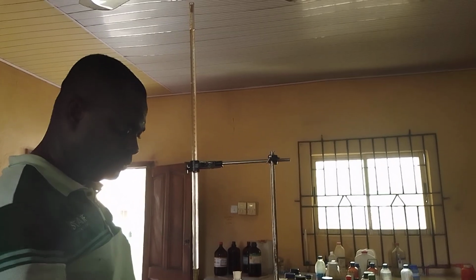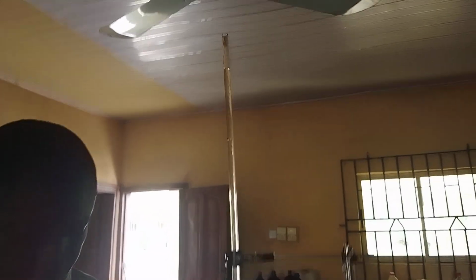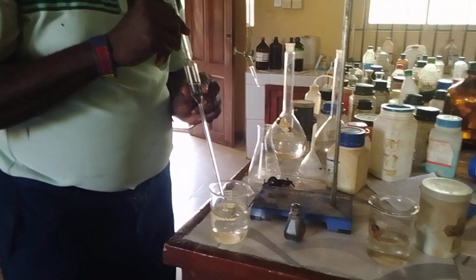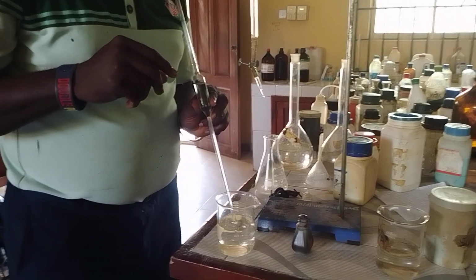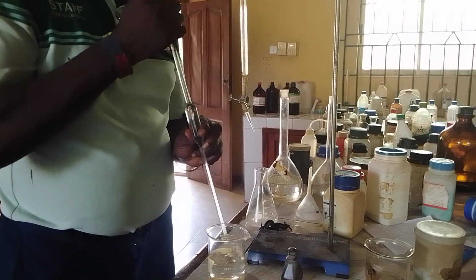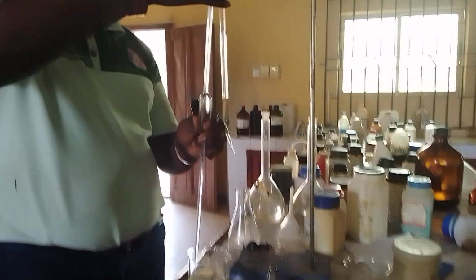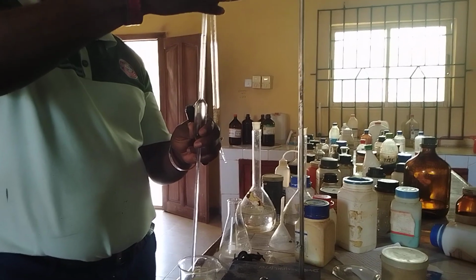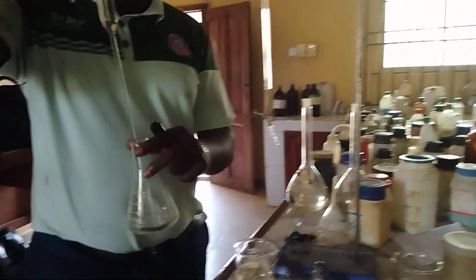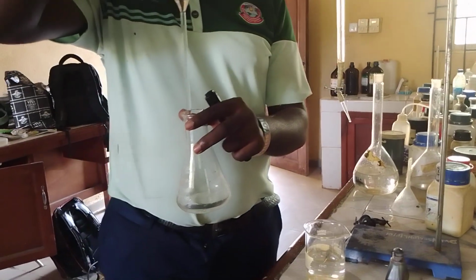Okay, so I want to pipette again. I have to swap. Okay, so I'm releasing this into the conical flask now.